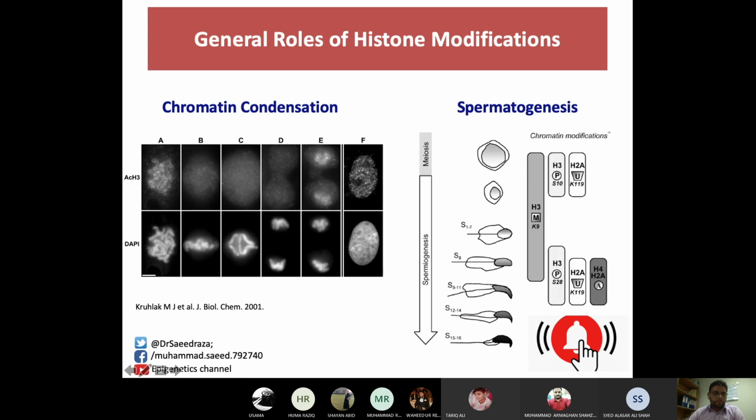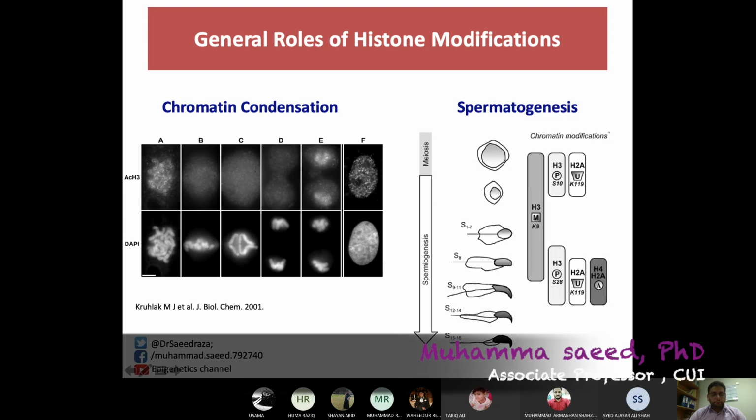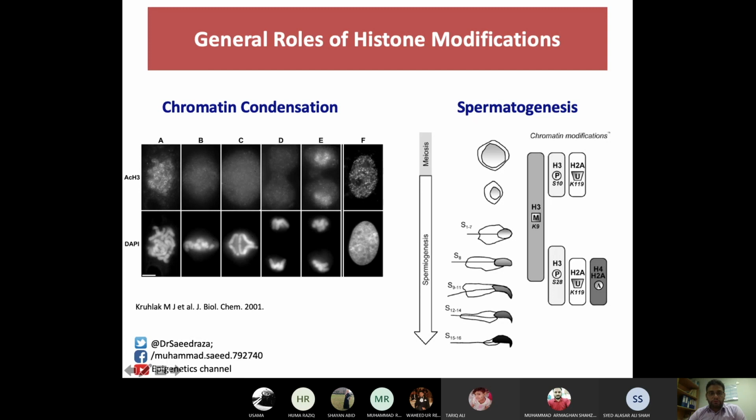try to make different settings where you can stain the DNA using this stain which is called DAPI stain, and you could also stain acetylation using this acetylated antibody against histone H3. You could see that both of these stains are giving almost the same arrangement of color pattern: wherever there is DNA present, there is acetylation going on there. This correlates very well with different cell cycle stages, and this tells you that acetylation is playing a very important role in different cell cycle progressions.